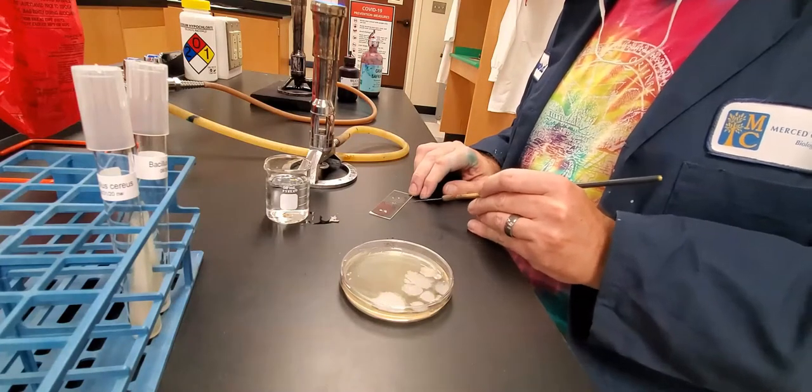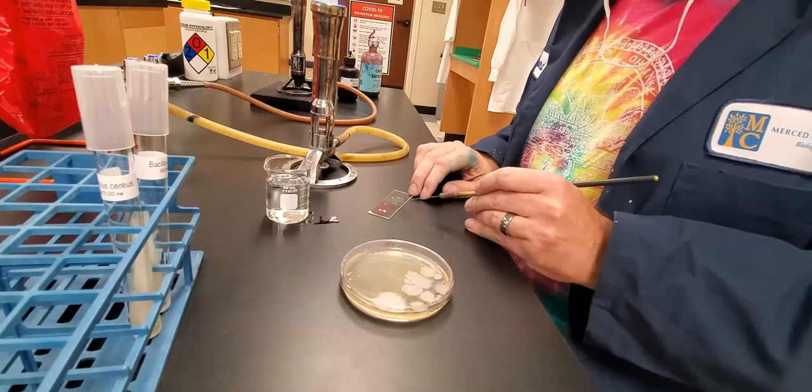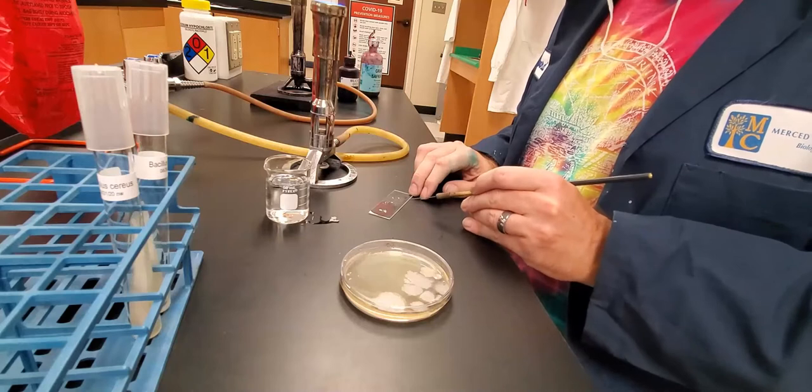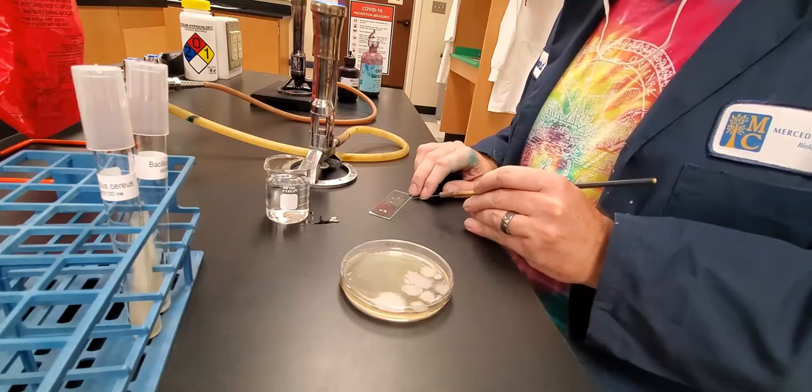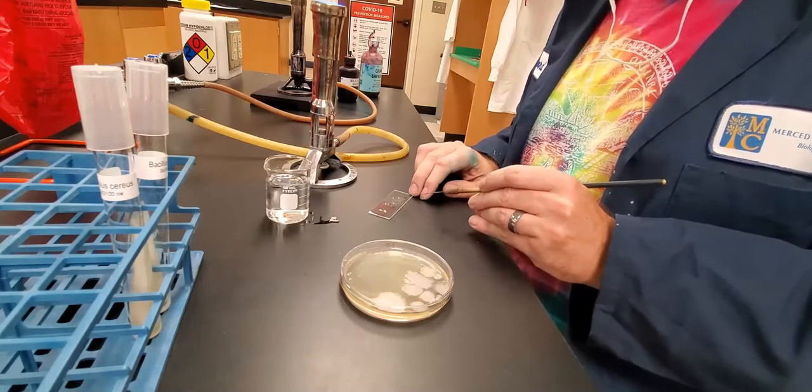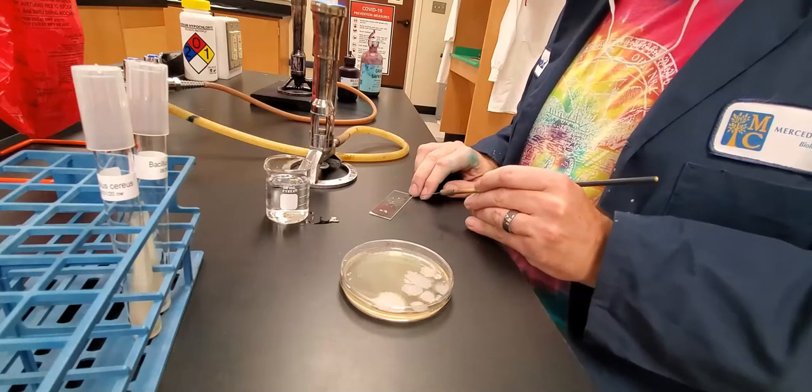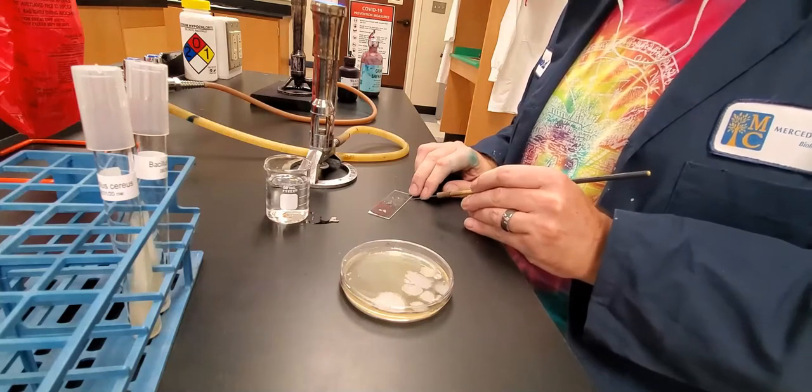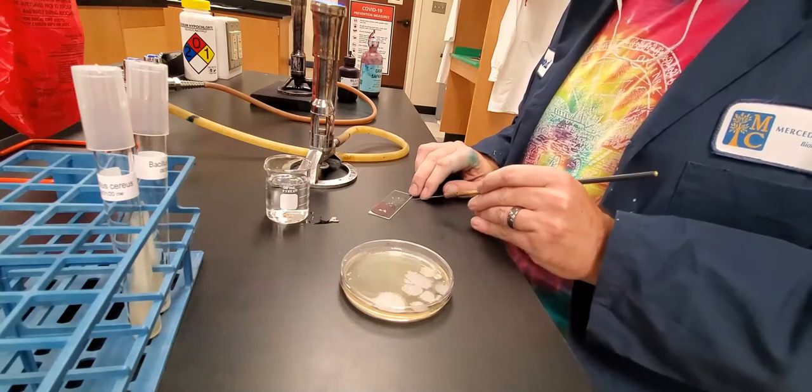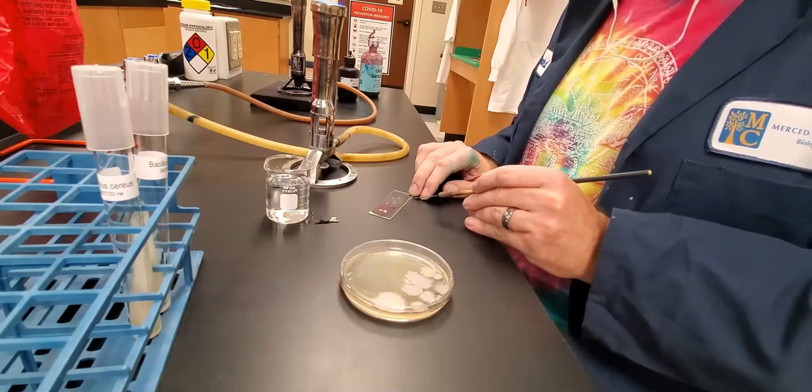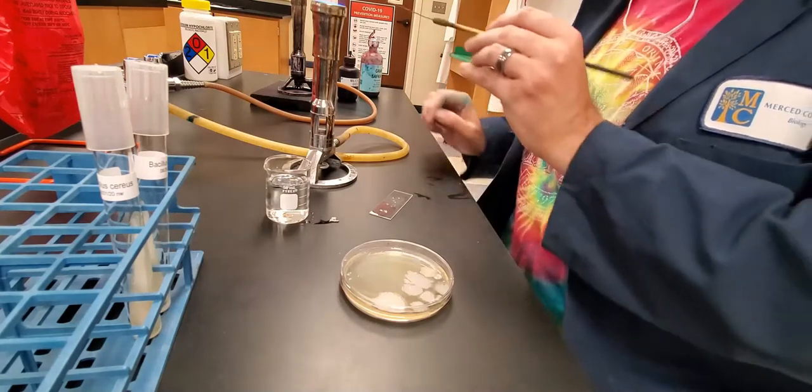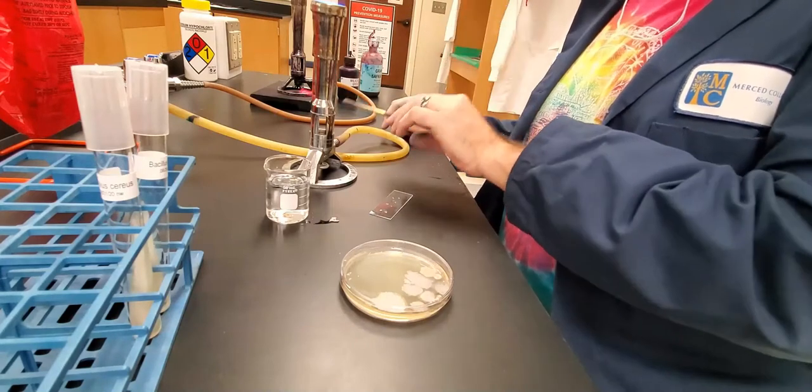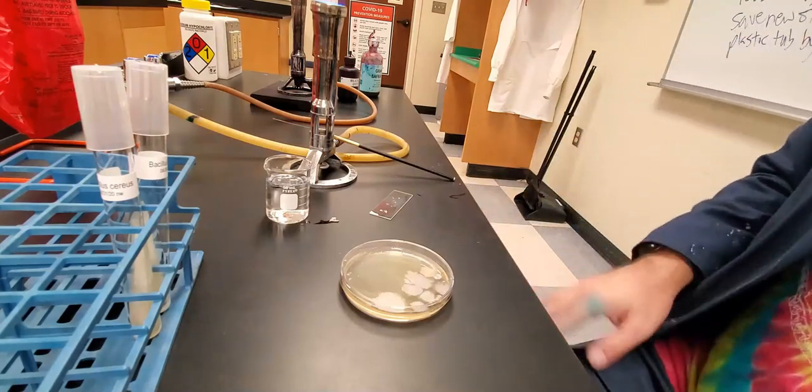The one thing I will mention here is just because you are using a bacteria for an endospore stain does not mean they make endospores. Endospores are something that are made when the cells are in an adverse environment where they can go dormant and protect their DNA. We don't always get spores. We have a few types of bacteria that we use that are more reliable at making the spores.